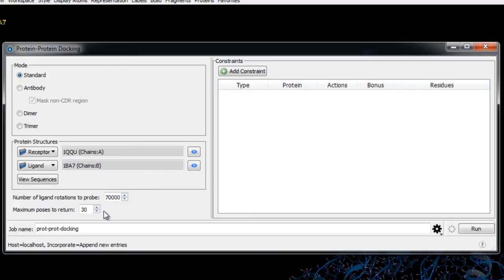Decreasing the number of rotations generally degrades the results but shortens the runtime. The second parameter is the number of poses to return. Each pose represents the center of a cluster that results from the clustering of the top 1,000 results of rigid docking of the ligand. If more clusters are found than the number of poses to return, clusters are ranked by size and poses are chosen from the largest cluster. If fewer clusters are found, one pose per cluster is returned.